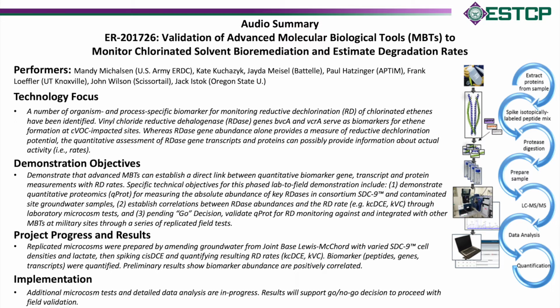Molecular biological tools, or MBTs for short, allow us to detect and quantify specific microorganisms and genes of interest in environmental samples, including groundwater. MBTs have been refined in recent years and are being used for site assessment and the identification of sites where bioremediation can be implemented as a productive remedy, and are also used to monitor the progress of bioremediation.